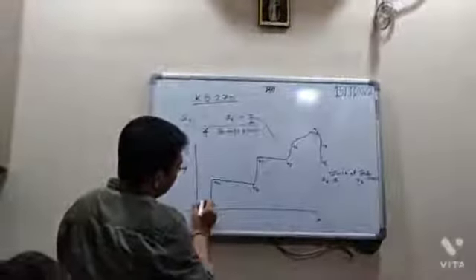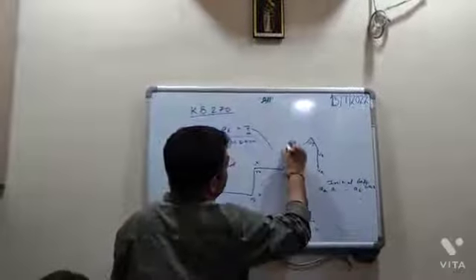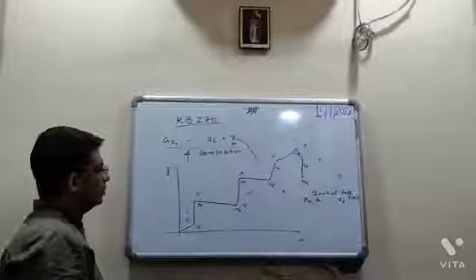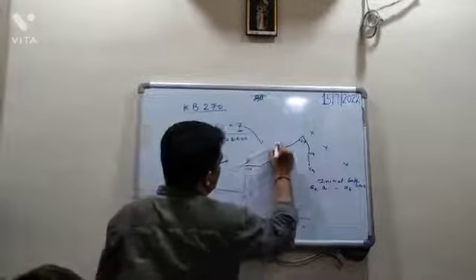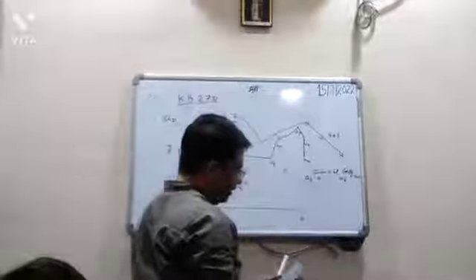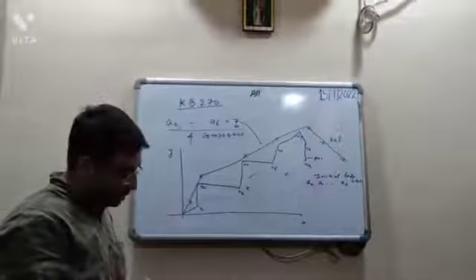So now this is, I'll say, the actual value. Now let's say we have other values somewhat here. There is something like that, right? So I can also plot this. This is a reference value. This is the actual value given by the instrument, right?